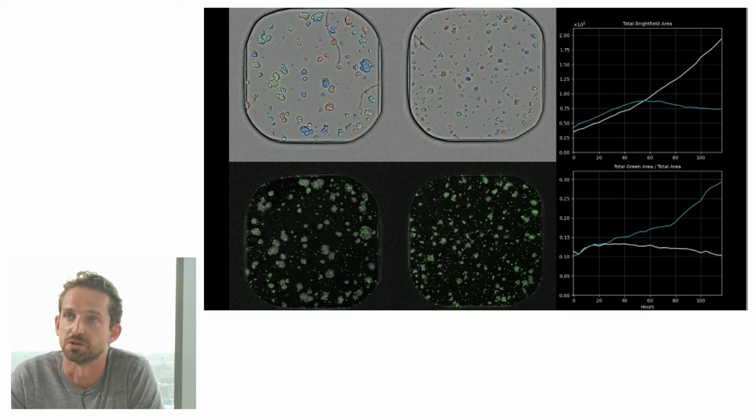This is an example of organoids grown in a high-throughput format microplate, and the software that allows us to track the growth of these organoids, either treated or untreated. We can also quantify, for example, the amount of cell death that is induced over time.